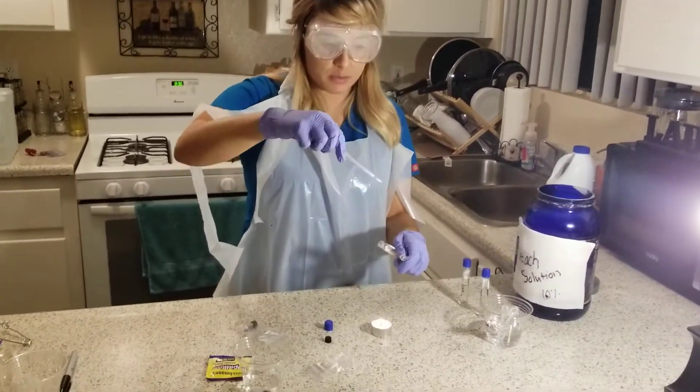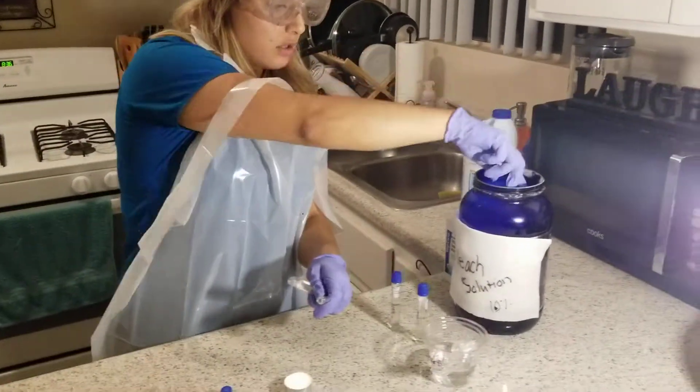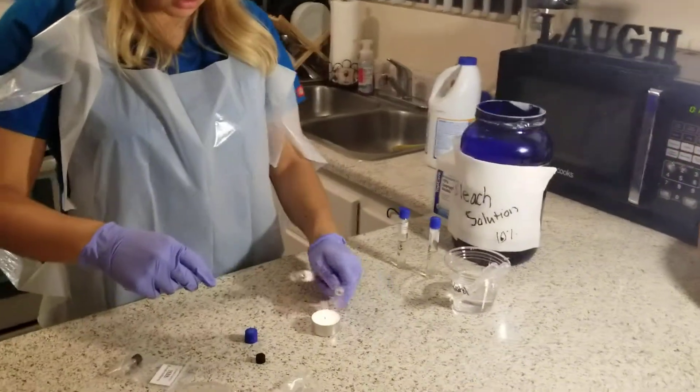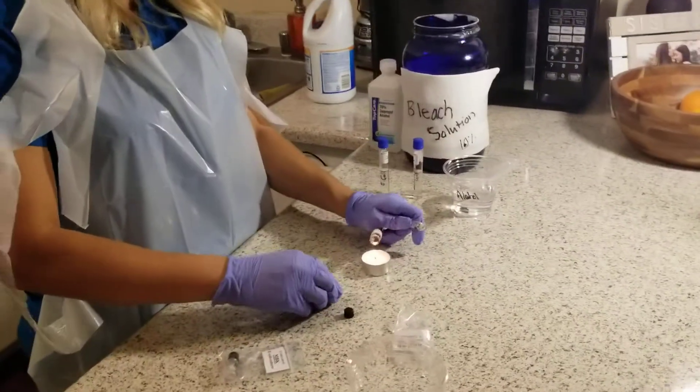I'm going to dispose of the pipette because it's now contaminated and put it into the 10% bleach. Then again sterilize both tubes and cap.